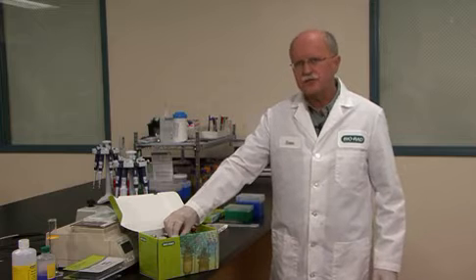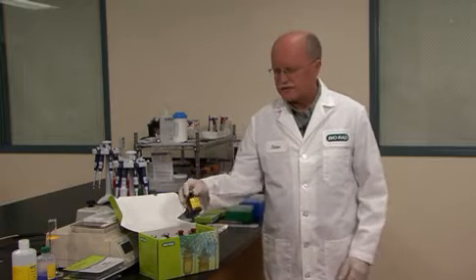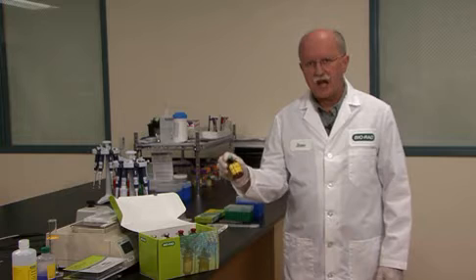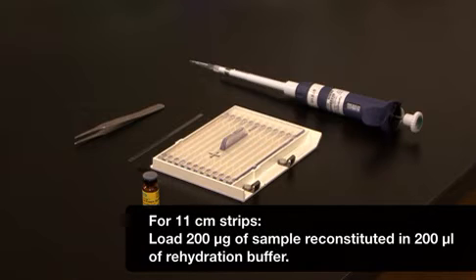The first step is to prepare the sample and the reagents according to the instructions in the manual. The components of the rehydration buffer are urea, CHAPS, DTT, Ampholite, and Bromophenol Blue. I will be loading 200 micrograms of E. coli sample that has been reconstituted in rehydration buffer onto an 11 cm pH 4-7 IPG strip.